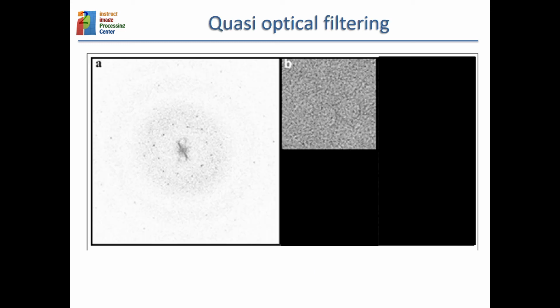Something also very nice of the Fourier transform is that you can define your filters in very specific ways. For instance, let's say that we have the electron micrograph of a crystal. A crystal is a repetitive lattice of macromolecules. On this repetitive lattice you have a lot of noise on top, but because it is repetitive, it happens like with the house: for the Fourier transform you will require energy from specific frequencies.